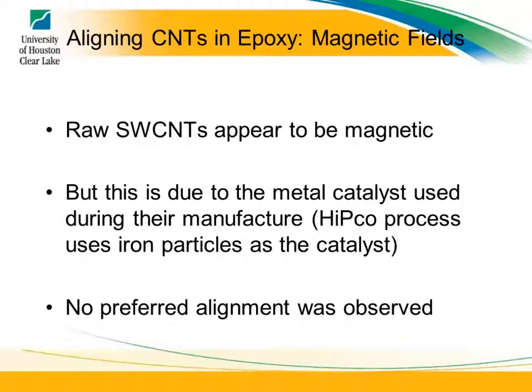So I looked at magnetic fields, flow, and electric fields, and magnetic fields is kind of interesting. Here's the nanotube sample. This is a magnet, attached to something metal and sticks that you use for an office table. But take a look at it. Yeah, I can hold that. They appear to be magnetic.